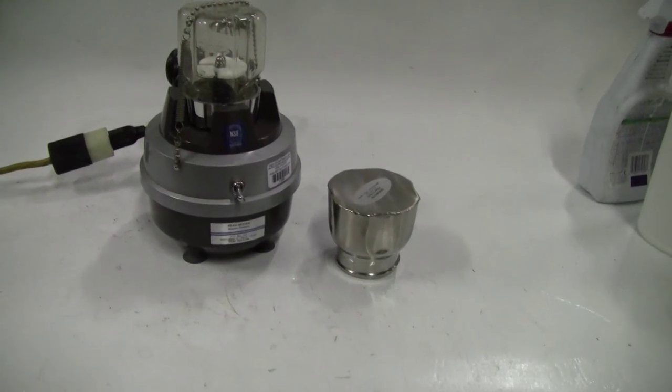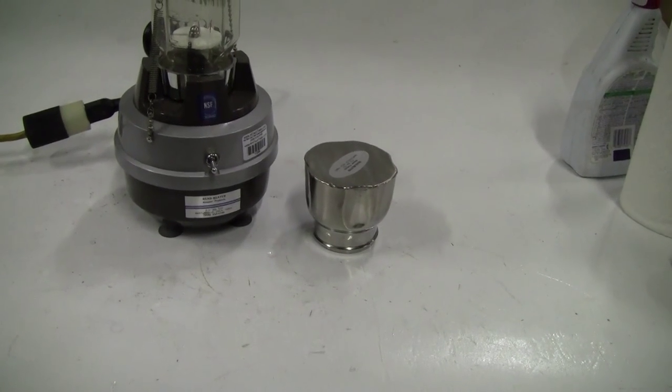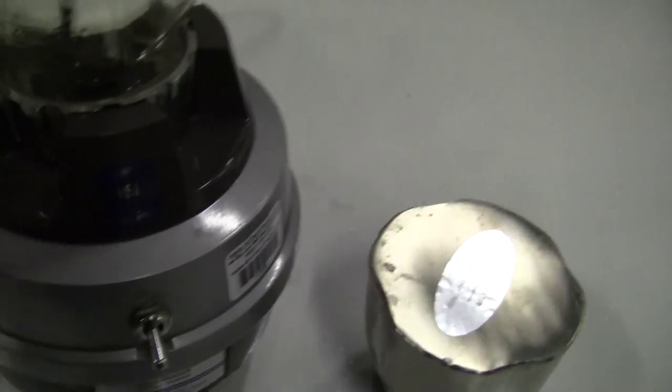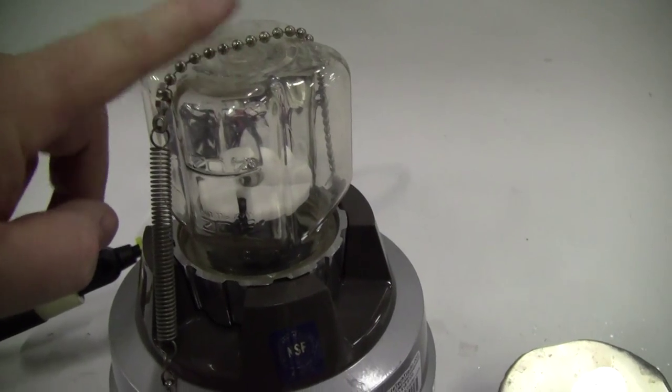Hi, this is Jim from High Tech Trader. Today we're looking at the Biospec Mini Bead Beater. This has a single speed. It comes with two different chambers, 350 milliliter, one a plastic one and one a stainless steel.